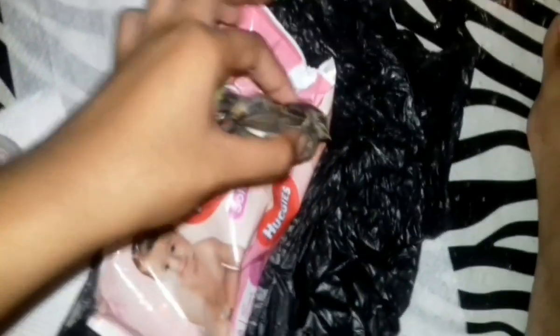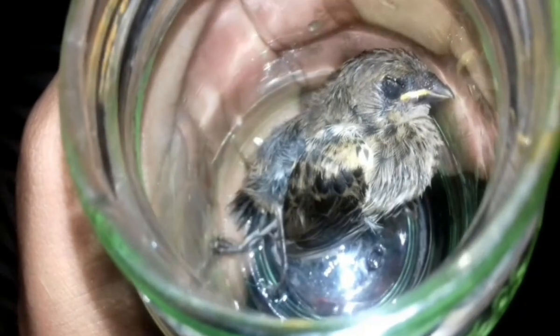Look at this little birdie — his eyes are closed. It's a little baby. I'm just gonna fix him up a little bit. Poor little thing, but he's frozen and he looks okay. I'll just hold him upright like that — nice, looks normal. Let me go wash my hands and I'll be right back.